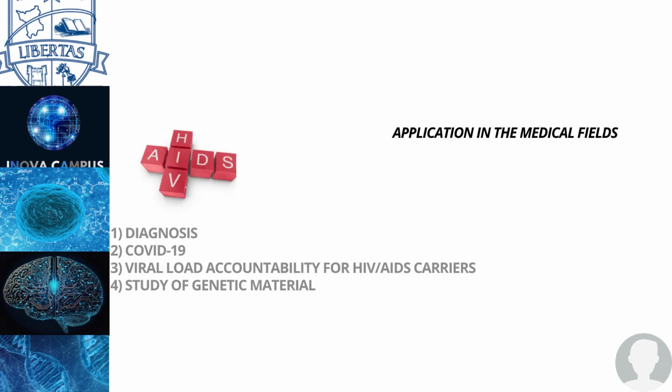The application of this test in the medical fields is, first, that we can have a very fast diagnosis, because it takes only a couple hours for the diagnosis to come out, like we saw in the COVID pandemic. And it helped a lot because we could have a really fast diagnosis, and the faster your diagnosis is, the faster you get your treatment.